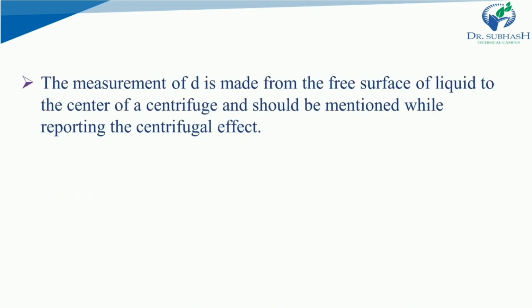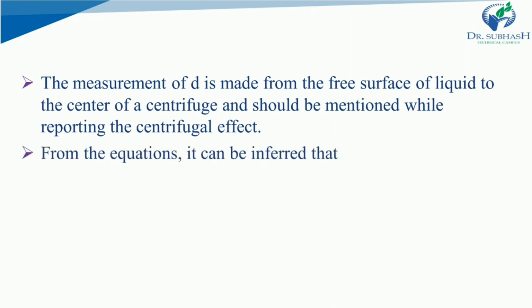The measurement of D is made from the free surface of the liquid to the center of the centrifuge and should be mentioned while reporting centrifugal effect. So this is really important. You have to measure the value of D from the free surface of the liquid till the center of the centrifuge, right?